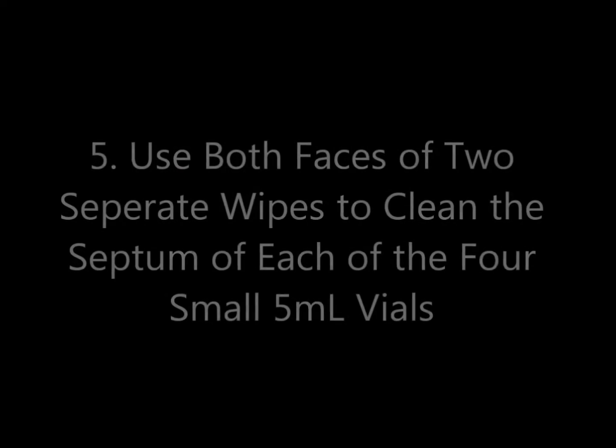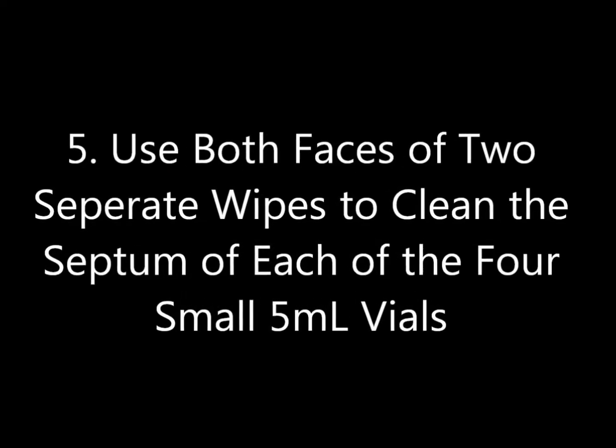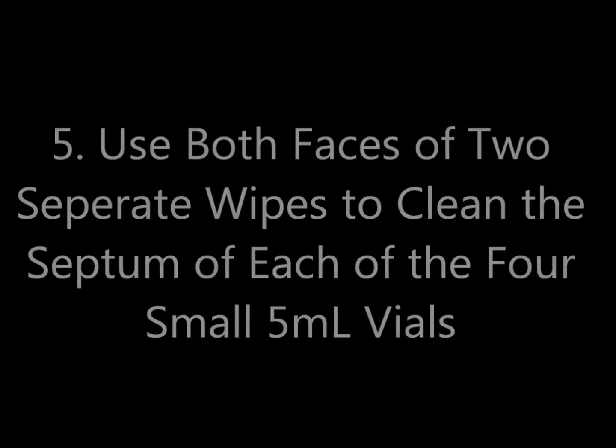Number five: use both faces of two separate wipes to clean the septum of each of the four small 5 milliliter vials.